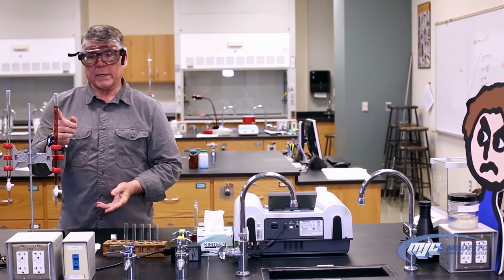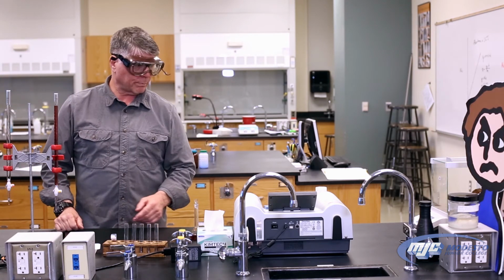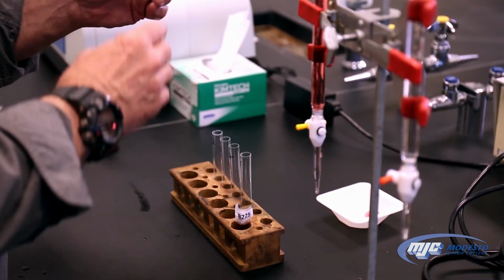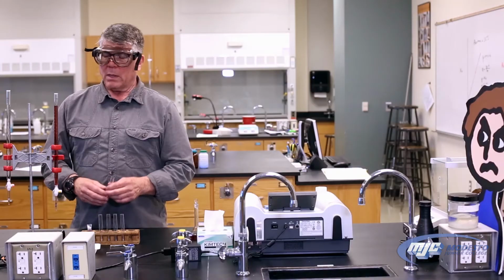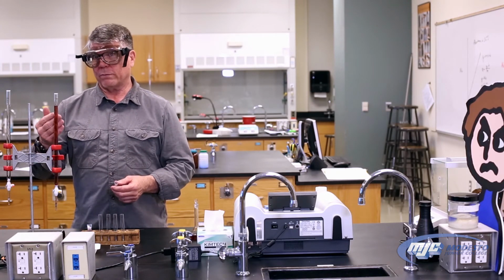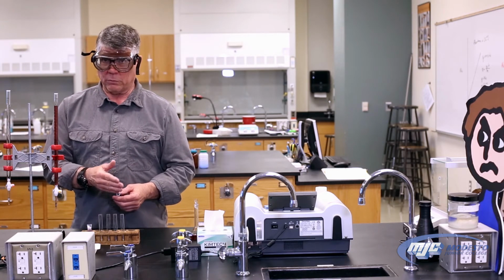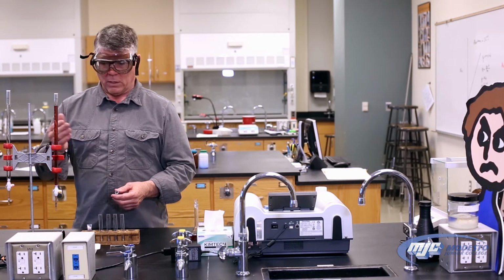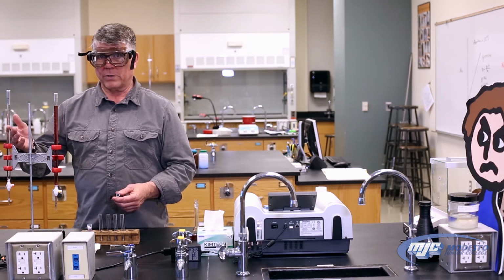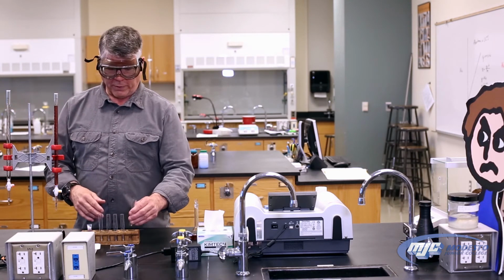I'm going to write in my data table my initial volume of my stock, initial volume of my water. I have 5 small test tubes that I've labeled 1, 2, 3, 4, and 5. In test tube number 1, I'm going to add about 1 milliliter of the stock and about 4 milliliters of the DI. Test tube 2, about 2 milliliters of stock, 3 of DI. Test tube 3, 3 of stock, 2 of DI, 4 of stock, 1 of DI, 5 of stock, 0 of DI for test tube 5.